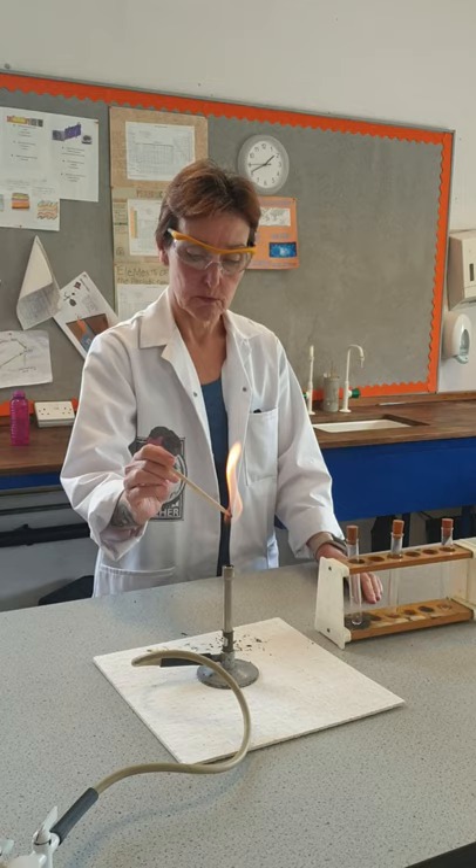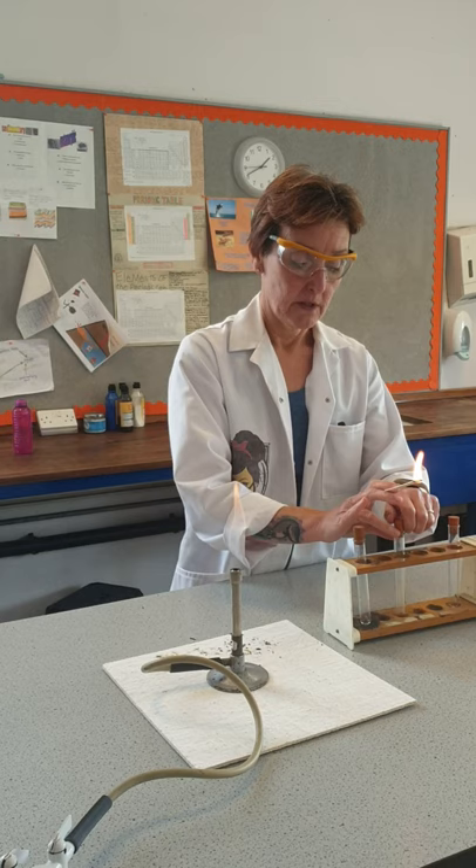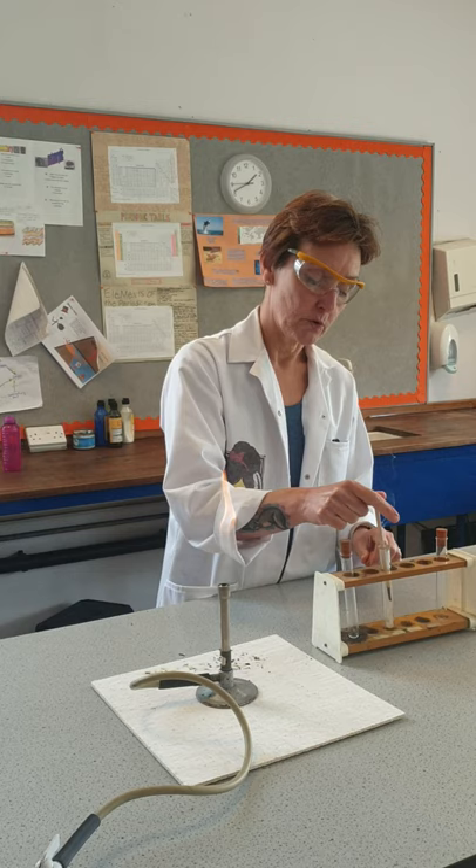Let's start with nitrogen. I've lit a splint. I'm going to take the top off the nitrogen carefully and pop the splint in, and the flame has gone out completely — and that's the test for nitrogen.